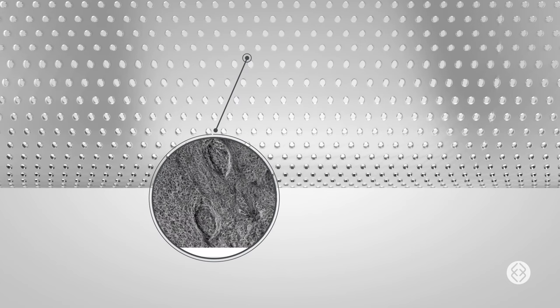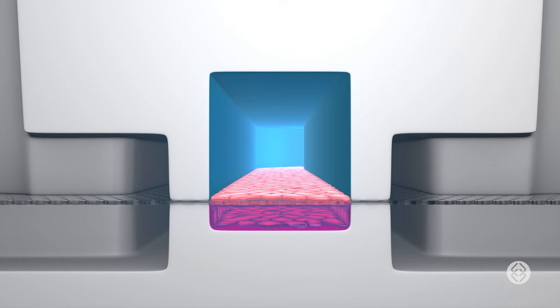The channels are separated by a thin, porous, stretchable membrane that allows for cellular communication between the two channels. It's coated with extracellular matrix proteins promoting cell attachment and assembly. Different cell types can be seeded into the top and bottom channels.